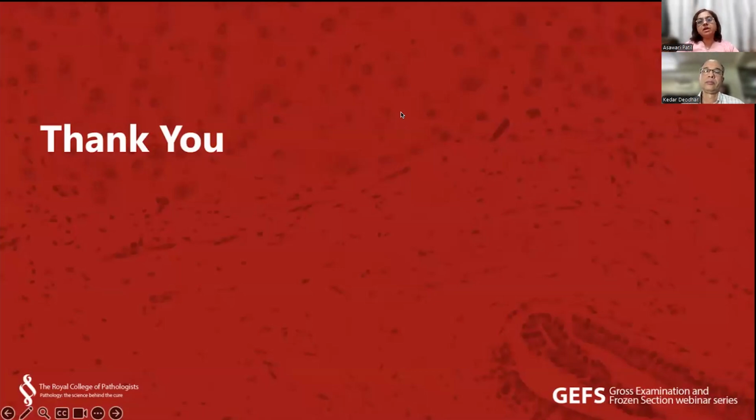Now here we cannot comment on depth of invasion or pattern of invasion if the biopsy is really fragmented. So there is some limitation for that. So the best way is we submit the entire tumor bed. We say that we don't see tumor in this specimen, and we have gone back and reviewed the biopsy, which shows the tumor. The grade of the tumor is this, the size in this biopsy is this much. If possible, comment on pattern of invasion, but many times it may not be possible.